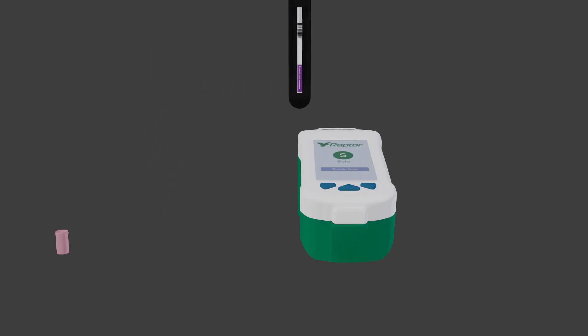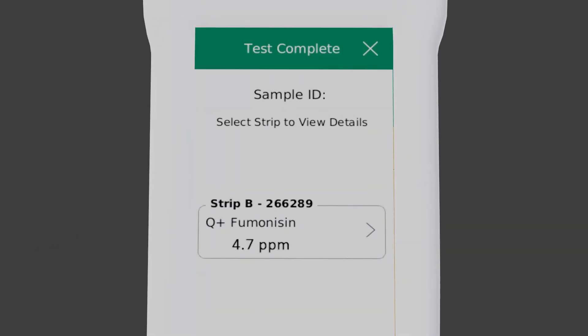Place Raptor cartridge into port. Add 400 microliters of sample to cartridge. Result will be displayed. Remember to multiply your result by the dilution factor. For this example, multiply by 2.